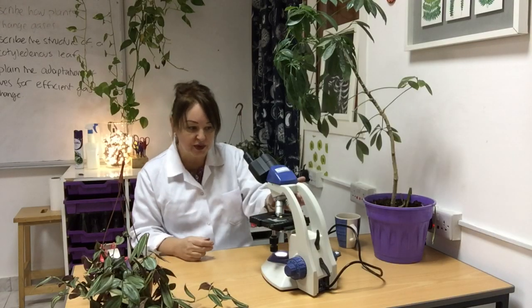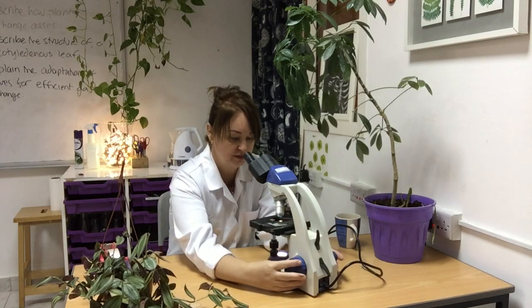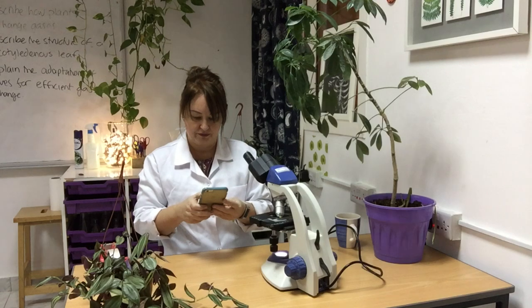Now trying the highest magnification, which is of course times 400. I'm going to roll it all the way up, rolling it away using the coarse focus. I've just got one lovely one in the middle there and one at the top — let me see if I can get a photograph of that. Lovely.